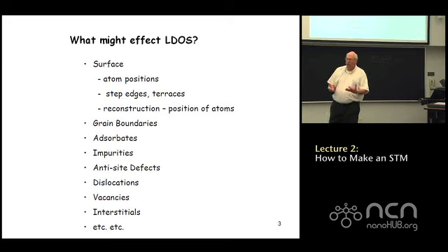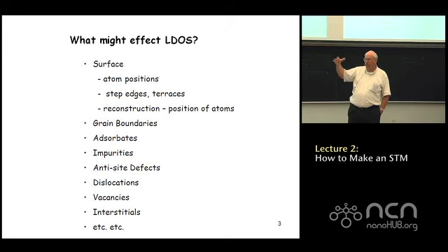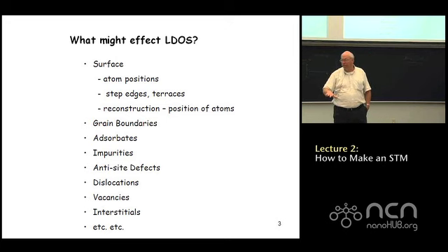Yeah. So the question is, since a scanning tunneling microscope really measures local density of states, if there's a fluctuation or a perturbation of the local density of states 2 or 3 atoms down into a metal, would that perturbation actually percolate up and be visible in the top layer? And the answer is, it kind of depends on the defect and it kind of depends on the material.